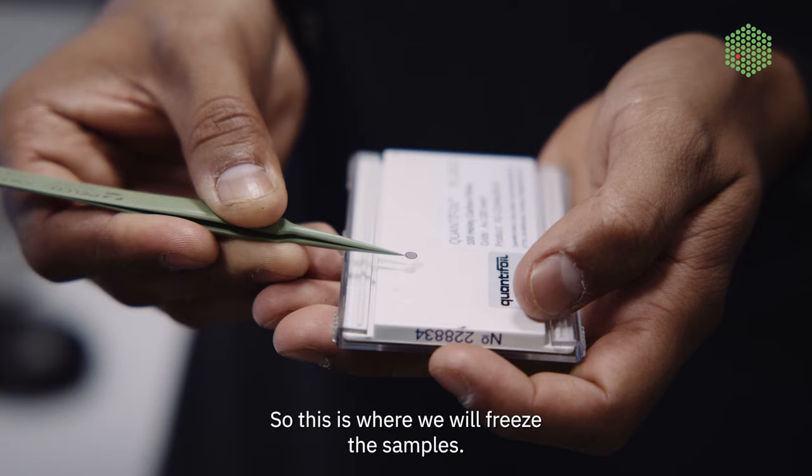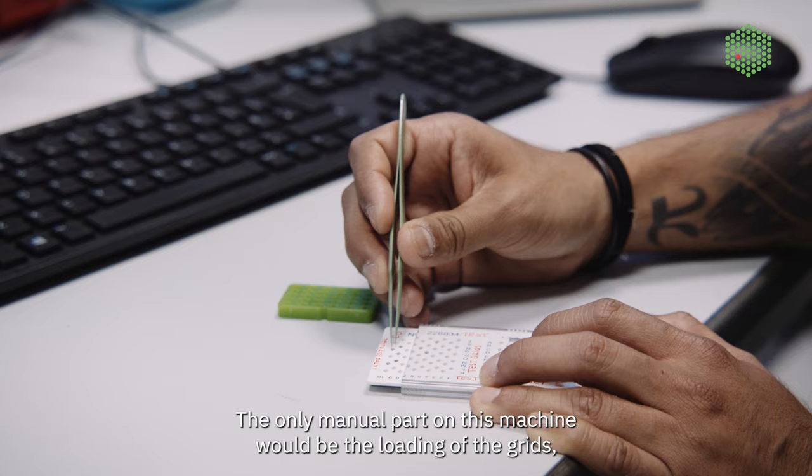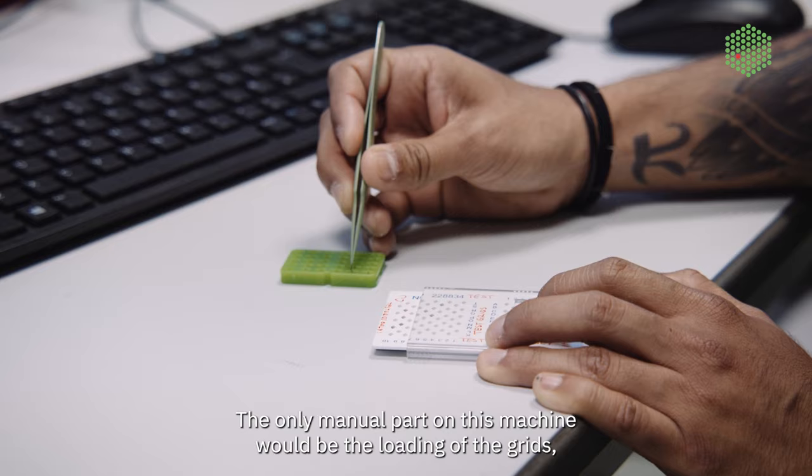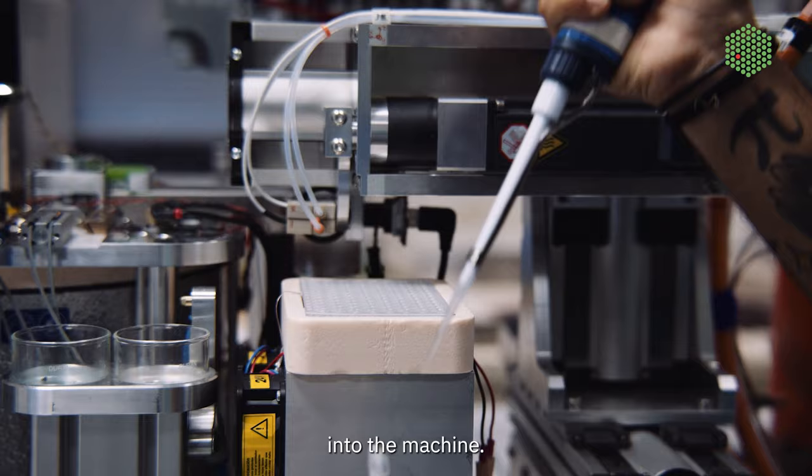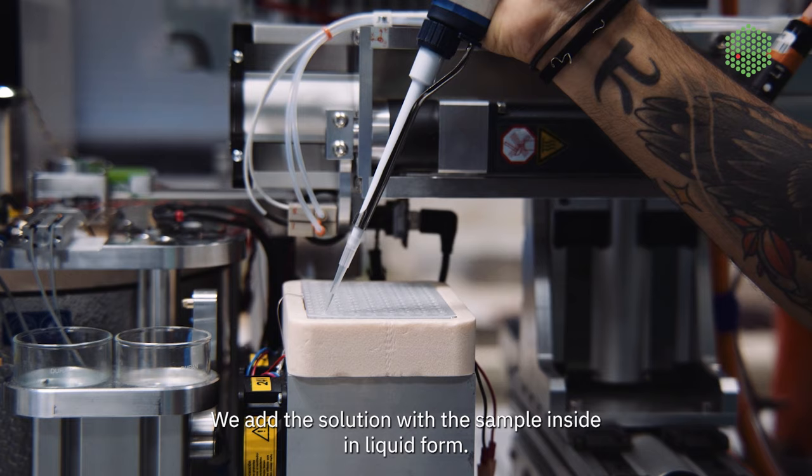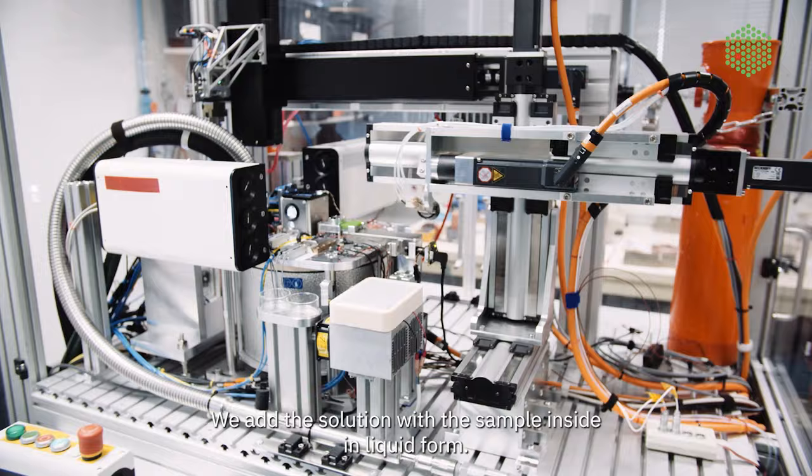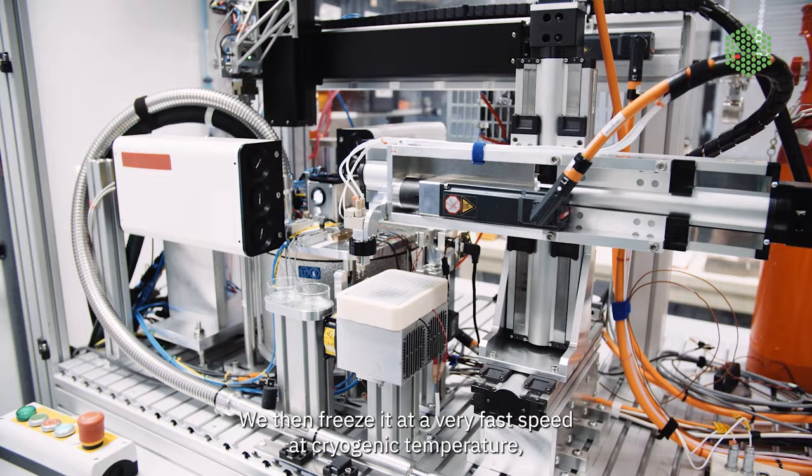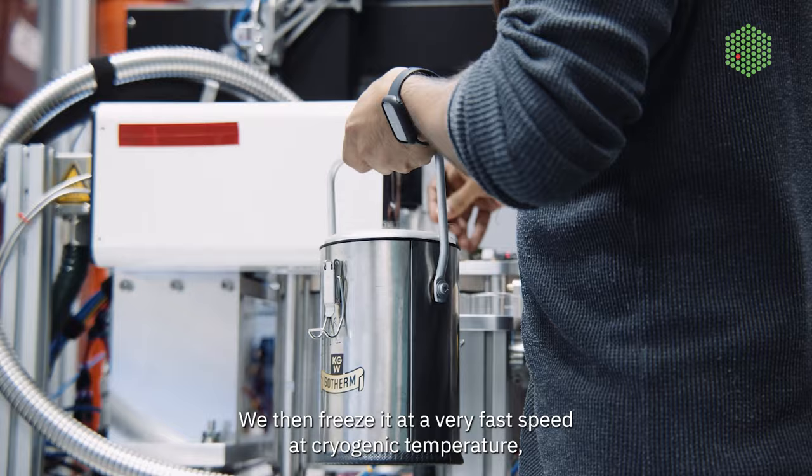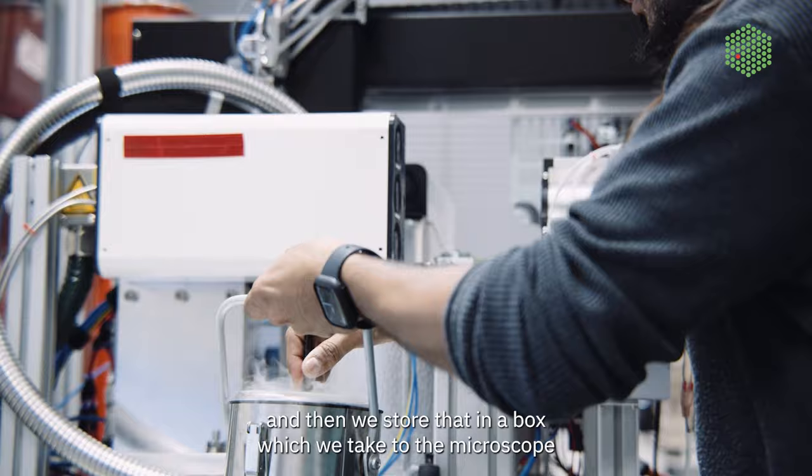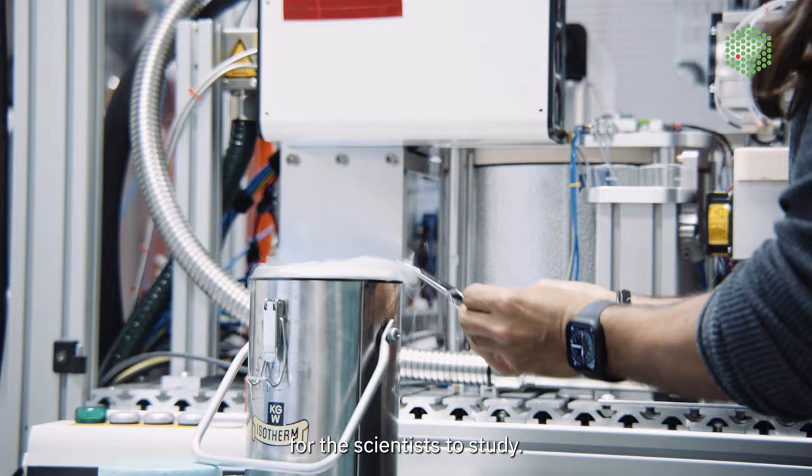So this is where we will freeze the samples. The only manual part on this machine would be the loading of the grids. And then just load them into the machine. And we add the solution with a sample inside in liquid form. We then freeze it at a very fast speed at cryogenic temperature. And then we store that grid on a box, which we take to the microscope for the scientists to study.